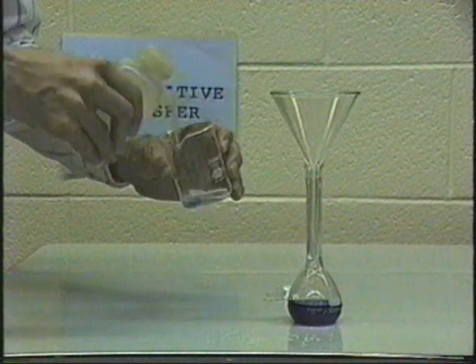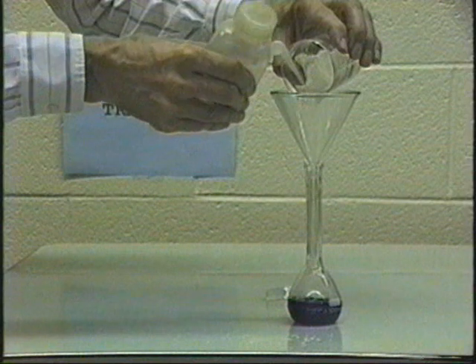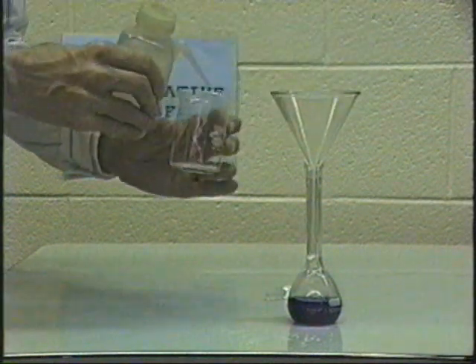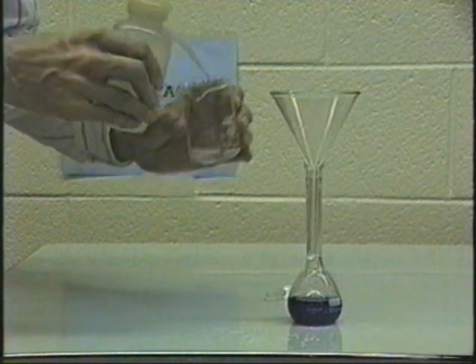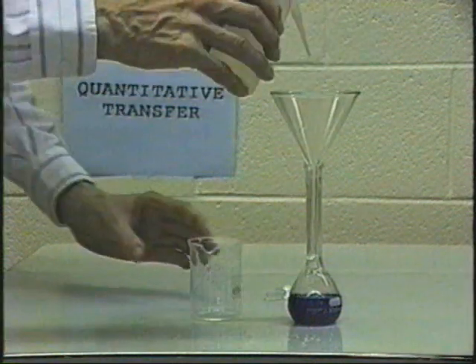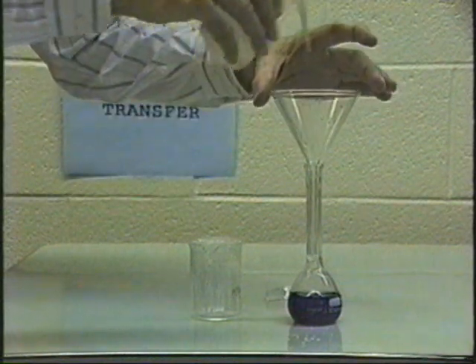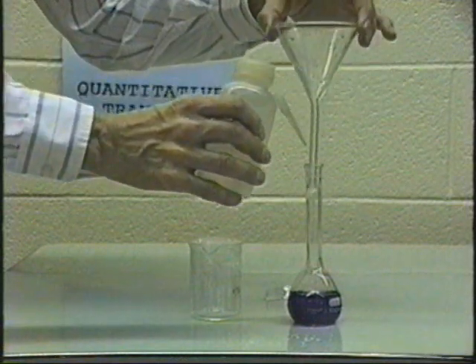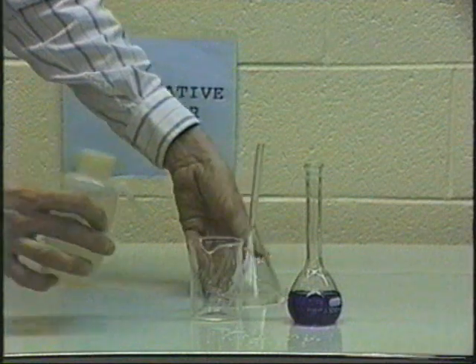Then you rinse the flask again, and you do this again. Again, make sure that there's nothing on the lip but distilled water. Do a second rinsing here. Then rinse the inside of the funnel. Make sure all the copper is out of there. Bring it up, rinse the outside of the stem, and we are quantitatively transferred.